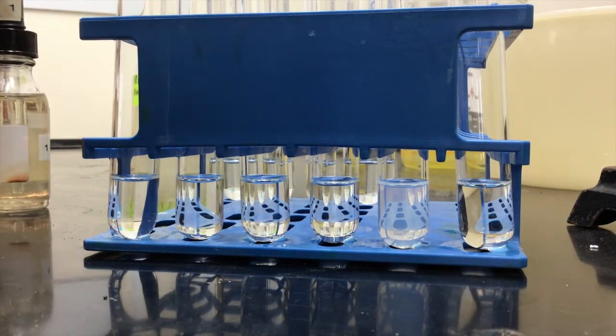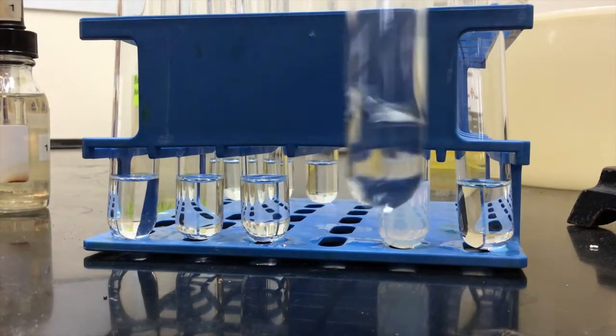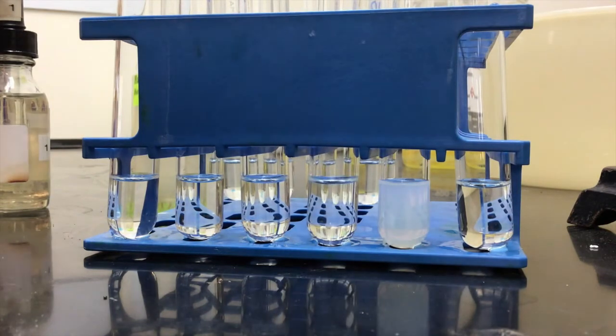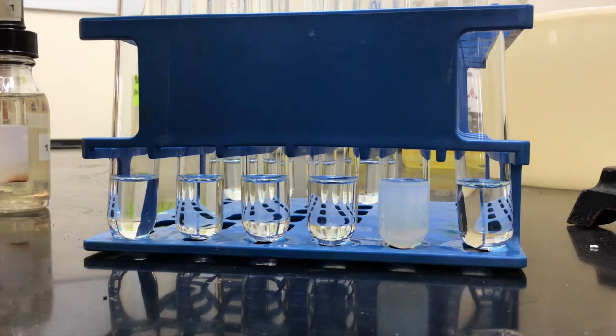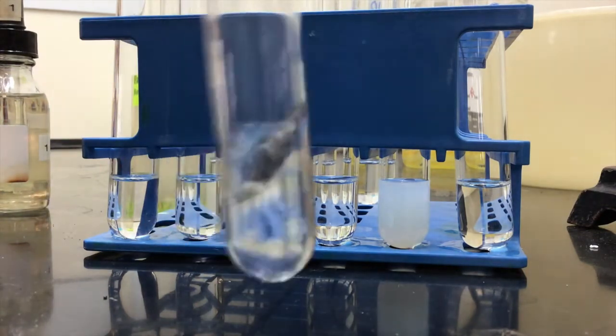Now number 3 is 1-chlorobutane. 1, 2, 3, 4 or so. There it is. 1-bromobutane for number 4. Shaky shake.